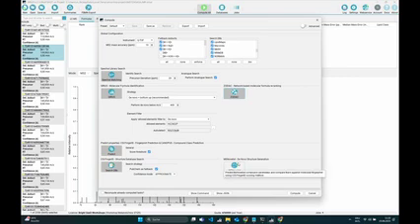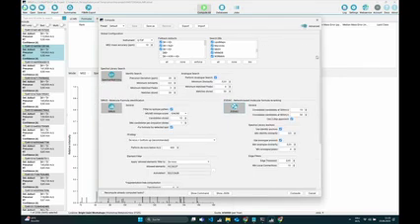So I hope this wasn't too much. I just wanted to go over everything quickly. If you really want to change more stuff, there is this advanced button, and then you get a lot more settings to set, but let's not mess with this here. Maybe one thing to know is that for at least some of the settings, you can hover over them, and it will give you some explanations on them.